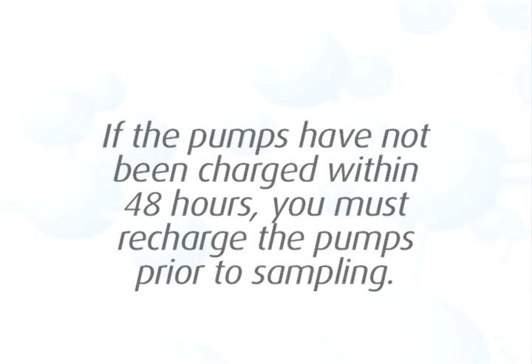To calibrate the pumps, they must be charged. If the pumps have not been charged within the past 48 hours, you must recharge the pumps prior to sampling.